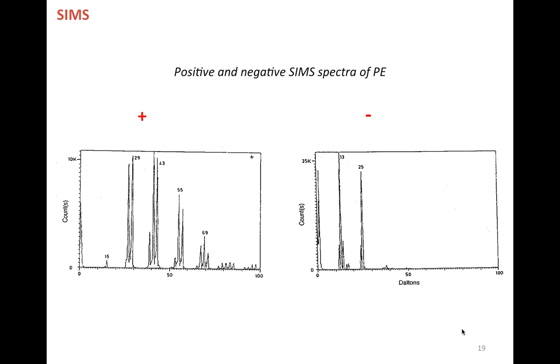So basically, you have chunks of this polymer, and the monomer is shown every 14 units, as you can see here. From 15 plus 14 is 29, plus 14 is 43, plus 14 would be 57, which is this small peak here.